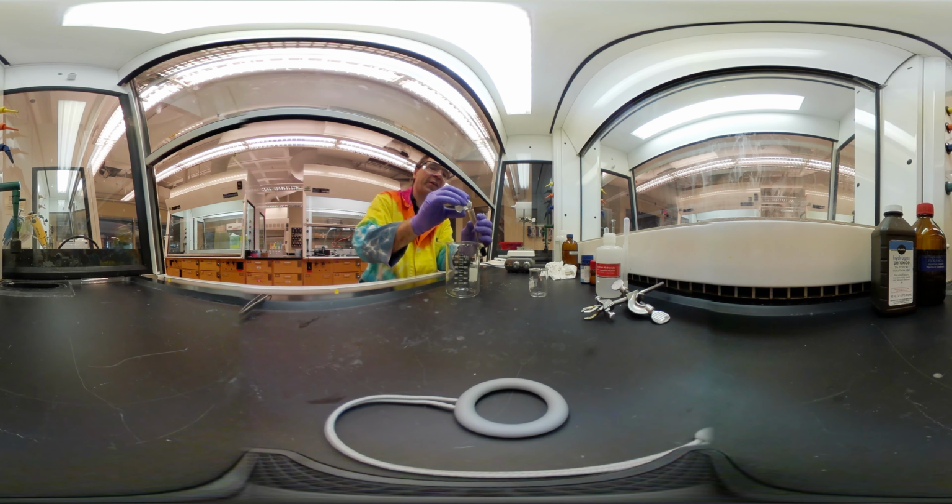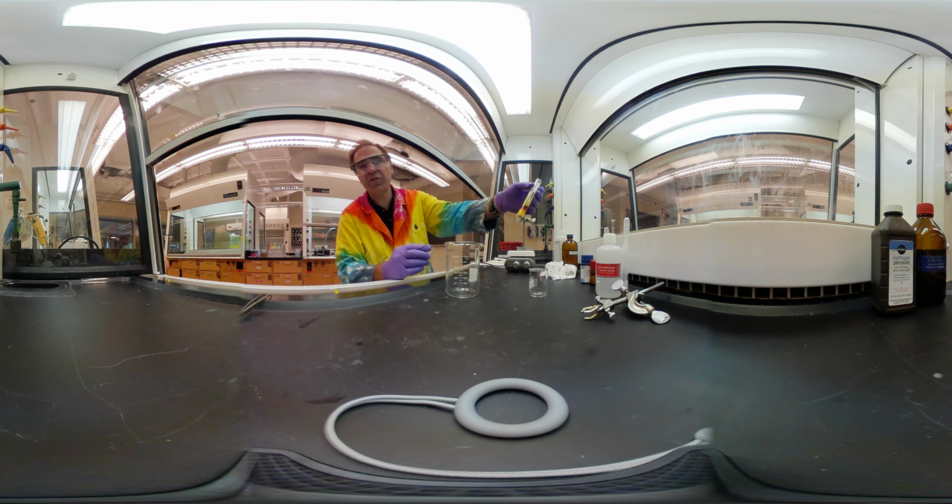Some of this is probably going to stick to the sides, but that's okay. We're going to use a little DI water. And we can use the water because there's already water in here, right? The sodium hydroxide was dissolved in water. Ooh, color change again. Okay.